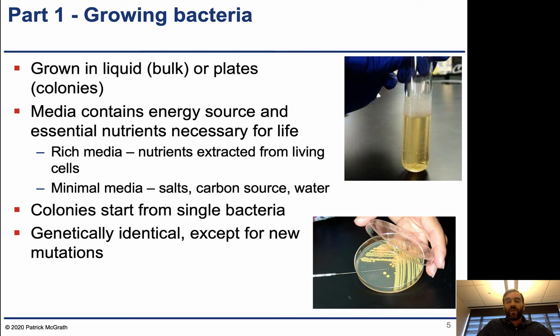So a lot of this is bacteria specific, and a lot of what we're going to talk about is related to E. coli bacteria. E. coli is kind of the workhorse bacteria of most laboratories. E. coli is isolated from your gut originally. It prefers temperatures such as 37 degrees, but it's also able to live in a large variety of media conditions.